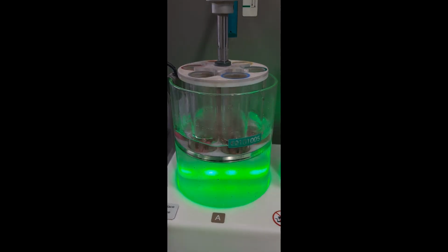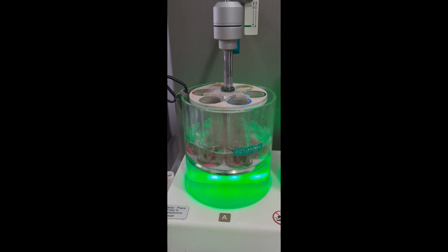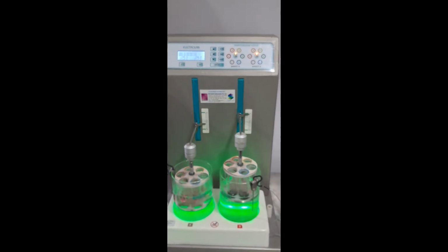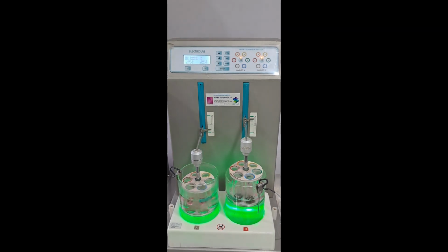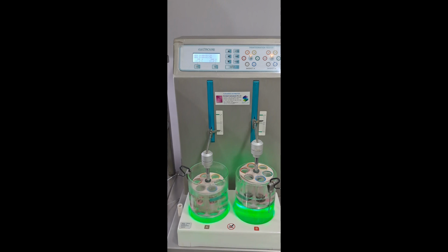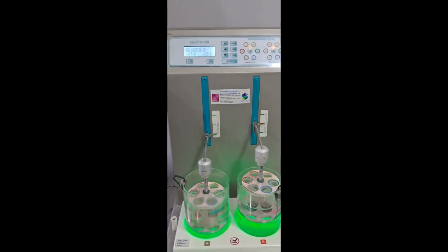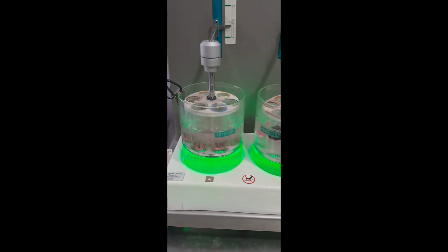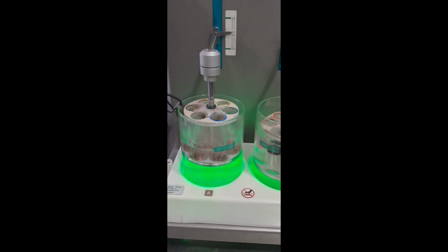Dosage forms where DT is generally not the primary test or not applicable. Extended release, sustained release tablets, capsules. These are designed to release the drug slowly over an extended period, not to disintegrate rapidly. For these, dissolution testing is the critical quality control test.